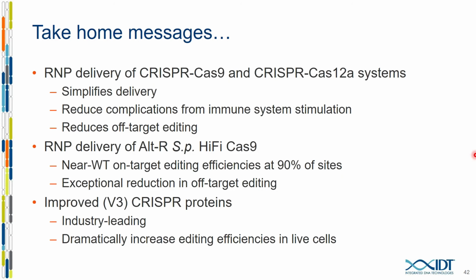Okay. Next, Theodore would like to know if there's any indication if the cRNA length can alter the cut site position. Well, that's an interesting question.